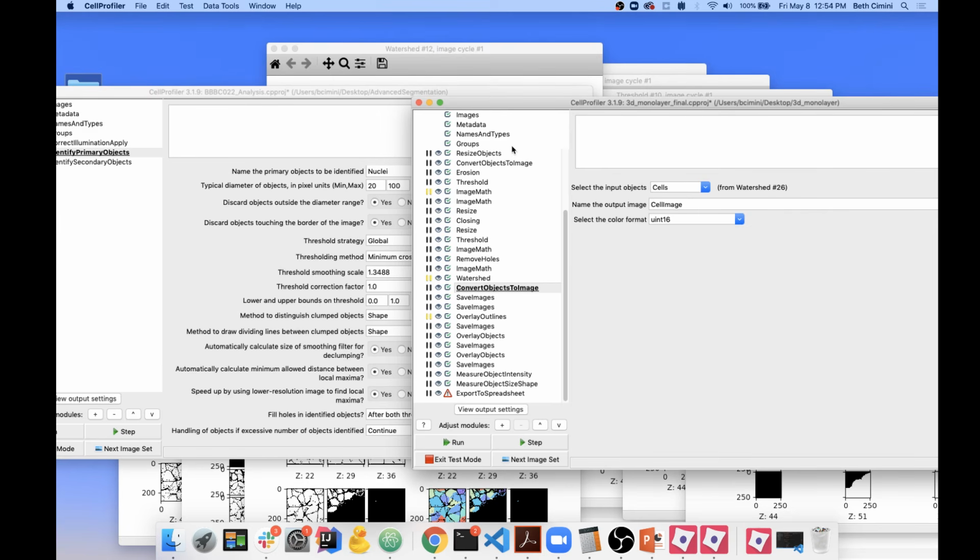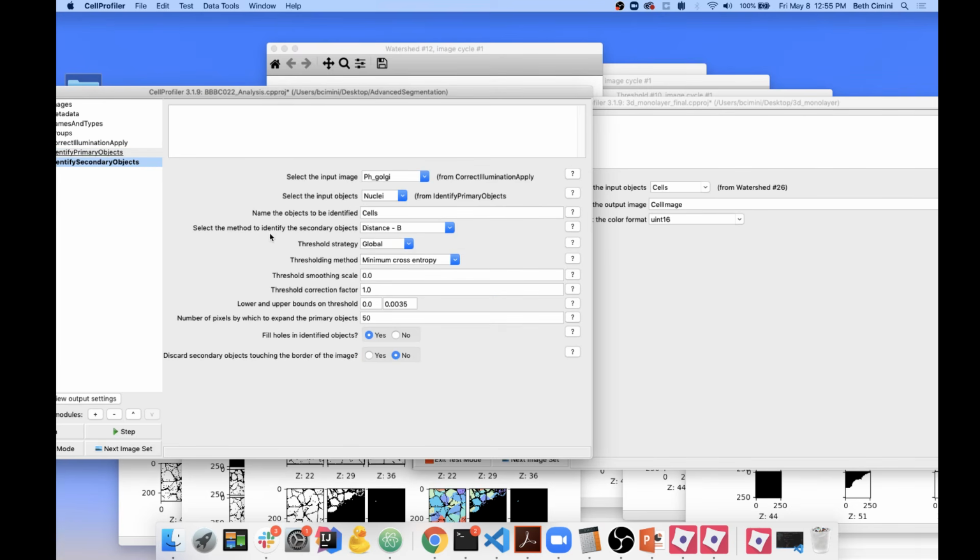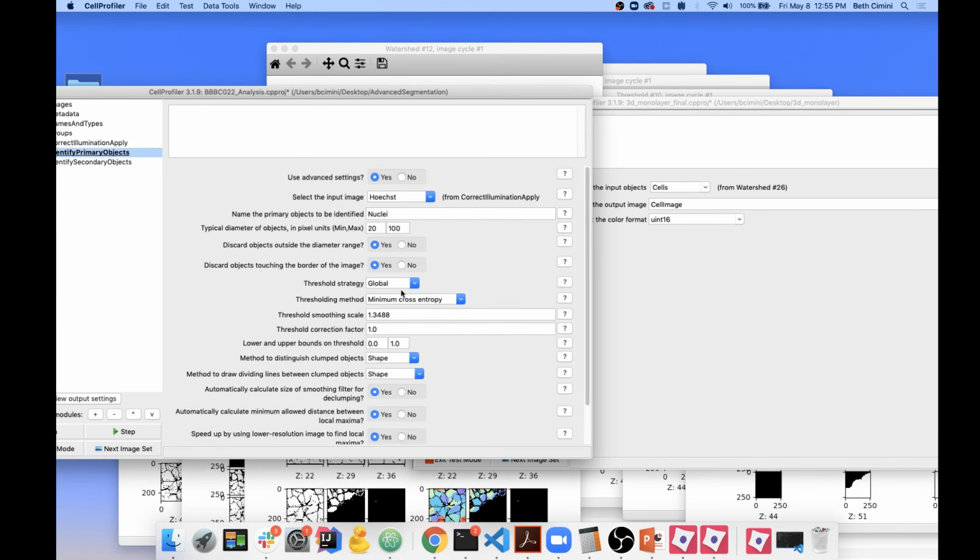I hope that's helped you understand a little bit more the objects that we have present, the options that we have present in CellProfiler for finding objects, and how you might change each of the different settings in order to find the things that you care about. It takes some work to try to go through, test on a bunch of images, and make sure that whatever settings you pick apply well across the board. You might need to put some boundaries on things, and you might need to try a few different thresholding options or a few different declumping options before you're happy. But overall, you should be able to find the objects you care about, generate measurements, and do good reproducible science based on that.